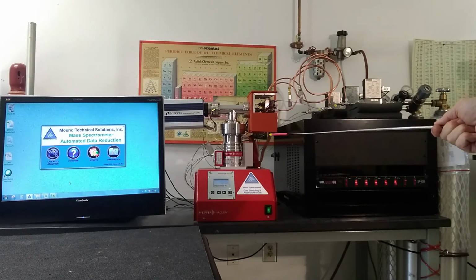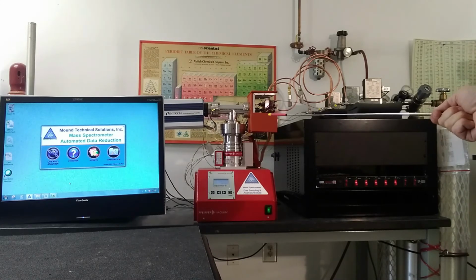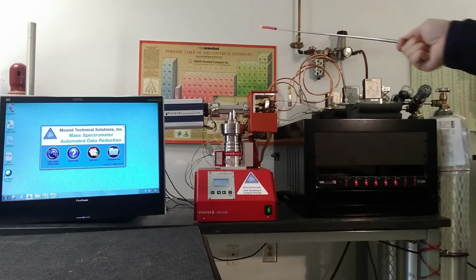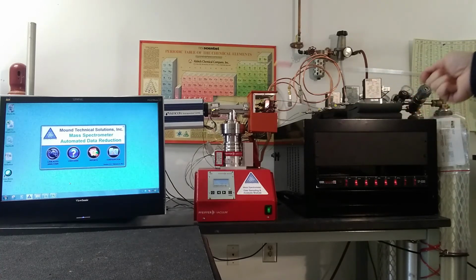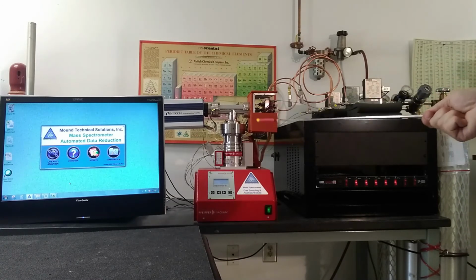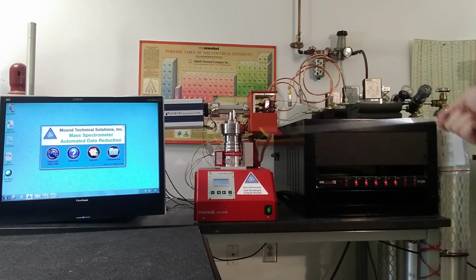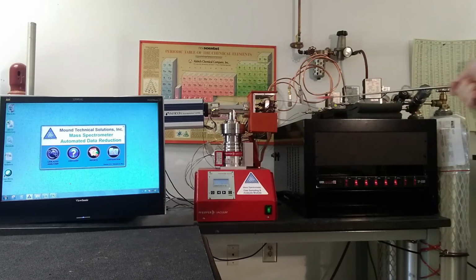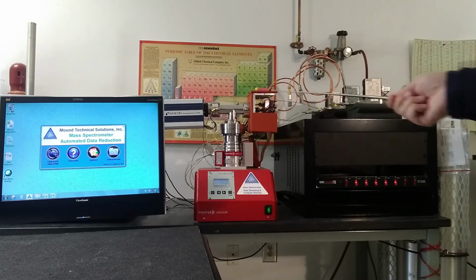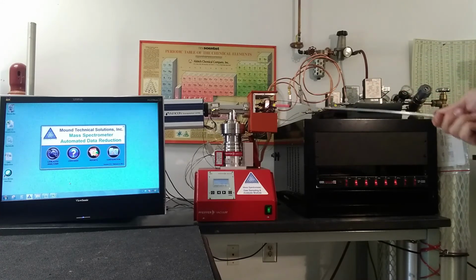In order to conduct this test, which is basically a feasibility study where we use existing hardware and evaluate the ability of the mass spec to perform the function, i.e. measure the oxygen content in multiple glove boxes. Can we do that quick enough? Can we do it in a rapid succession by multiplexing the 1 unit amongst the 8 or more glove boxes? And can we get the accurate data that we want? And what does that data look like?